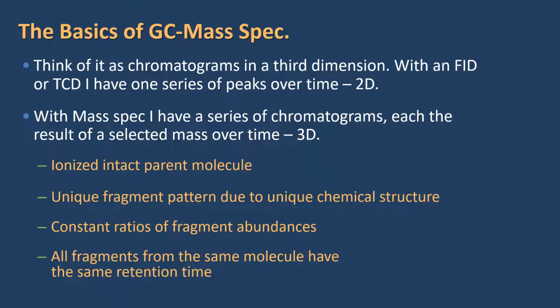All fragments from the same molecule have the same retention time. So basically, I'm collecting all of these chromatograms. Each one is a function of a mass, and I can go in and individually look into those, generate separate chromatograms, and use that for quantification. We'll look at that in a second.